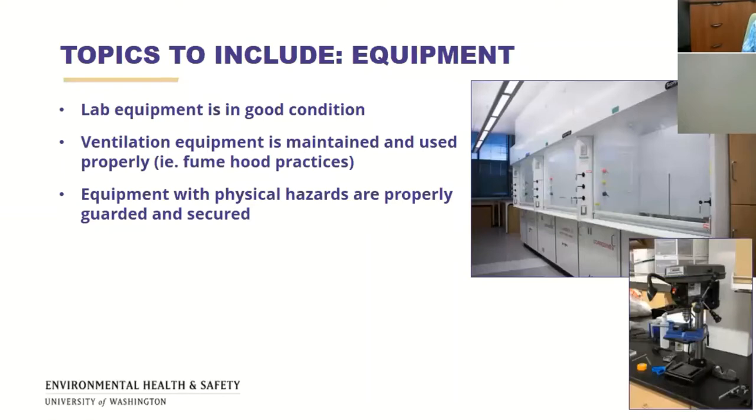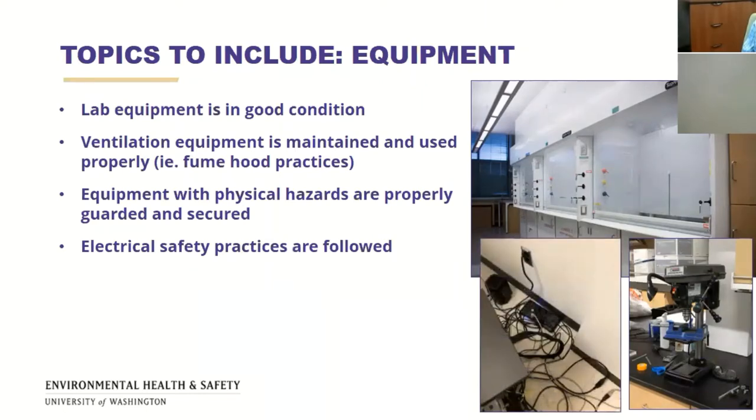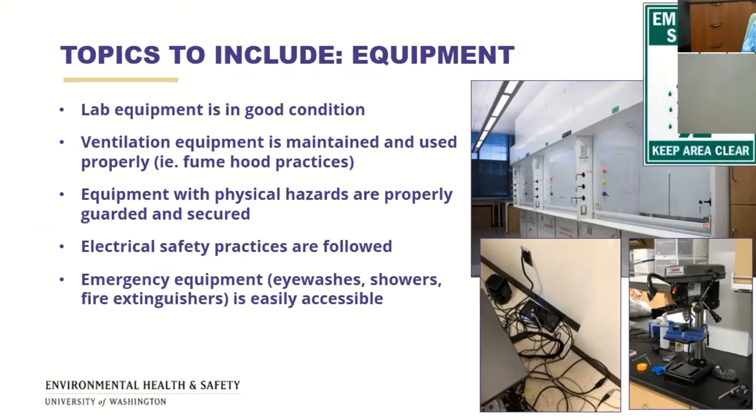Check that equipment with physical hazards are properly guarded and secured. Check to see if electrical safety practices are being followed. And check that your emergency equipment is free and clear and easily accessible. This includes items like eye washes, showers, and fire extinguishers.